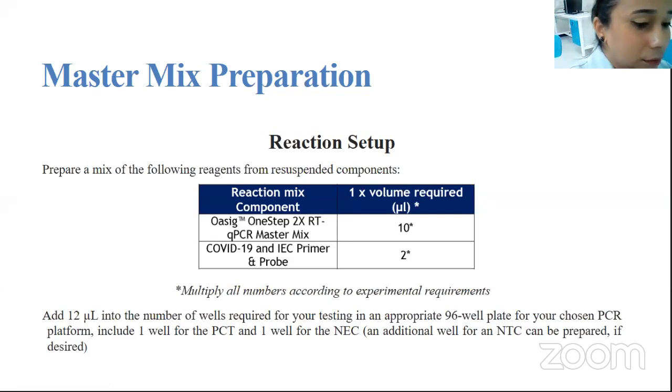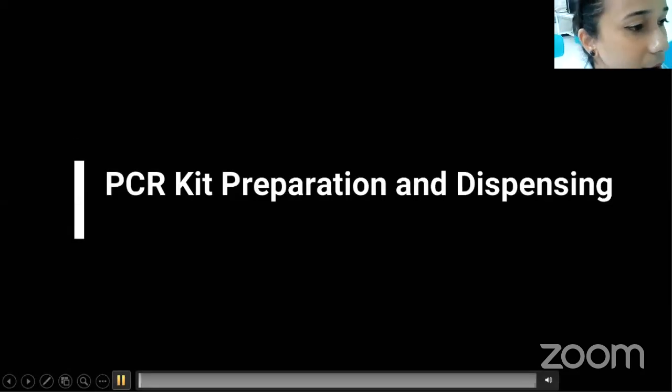Okay, let's see a video about how to resuspend these.